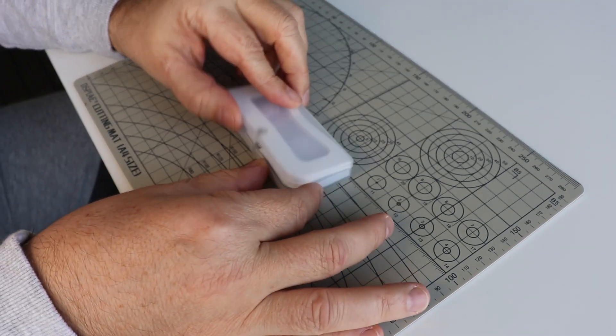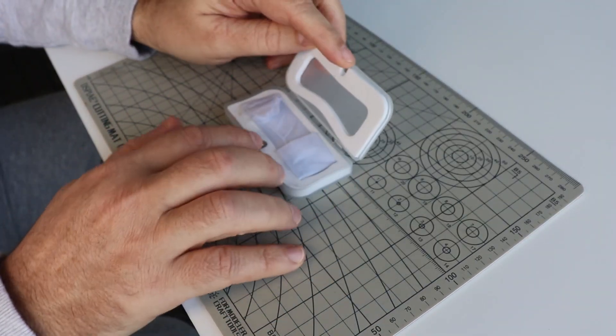The ruler arrives in this nice box and it doesn't have a clip but it's closed with these magnets.